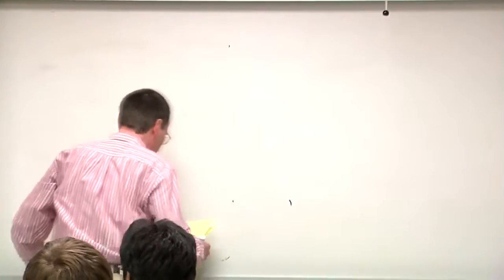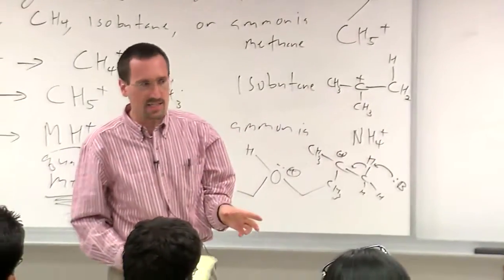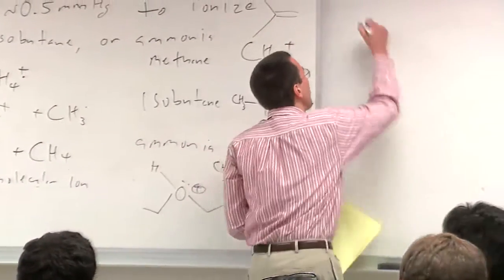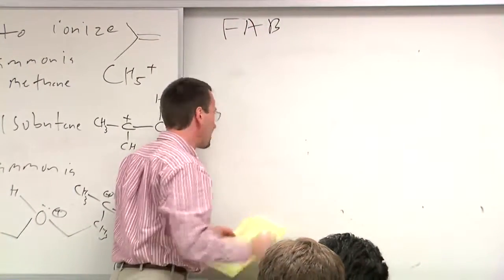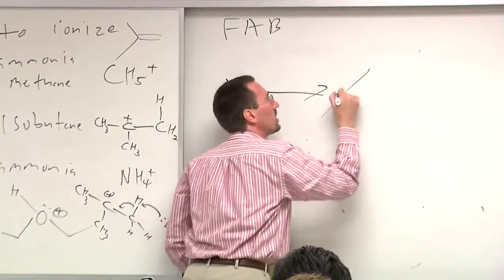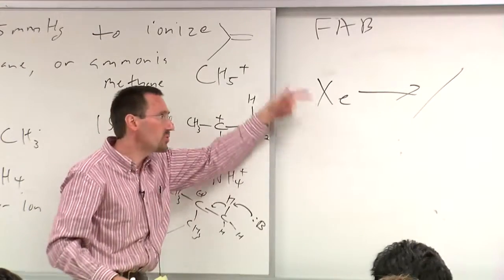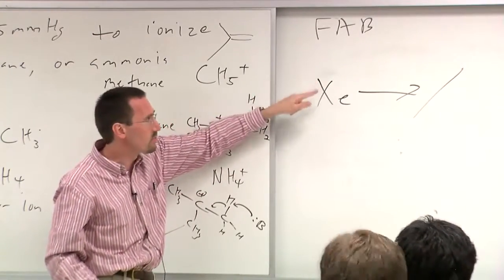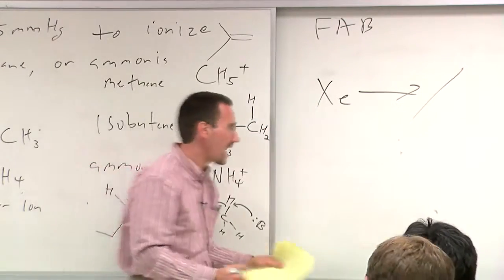Soft ionization techniques, in which the ionization process gets the molecule into the gas phase, solve this. Fast atom bombardment was, I think, the first one developed. In that case, you take an atom that's moving quickly, and you actually do that by an electrical process to ionize, accelerate, and then reneutralize that atom.